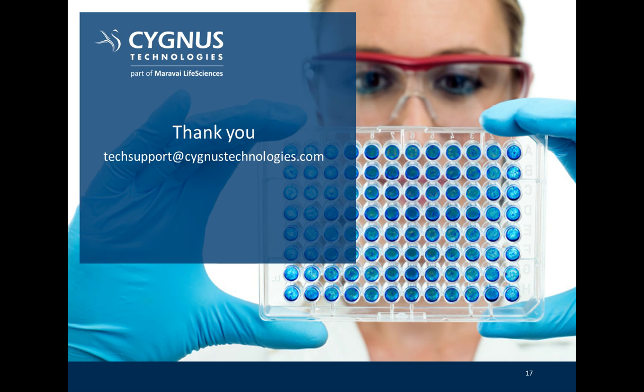Okay. And for AAE, how do you capture your antibodies, and how do you ensure that no antibody isotypes are preferred?